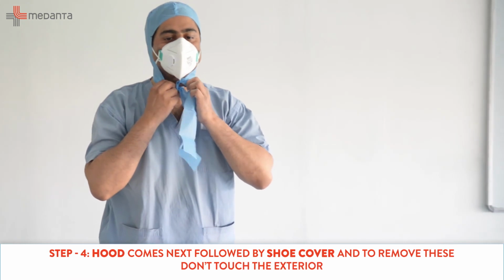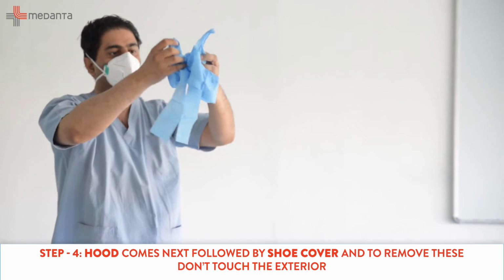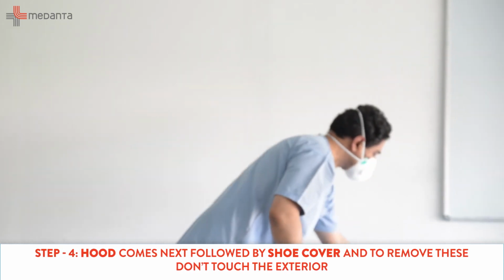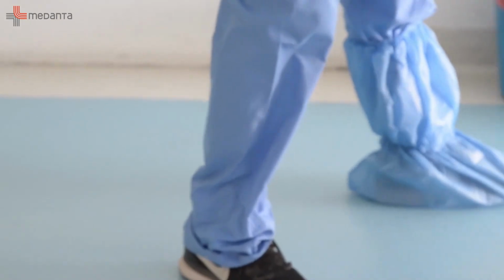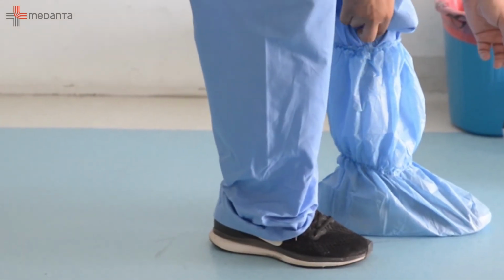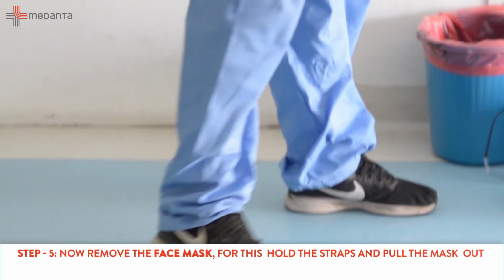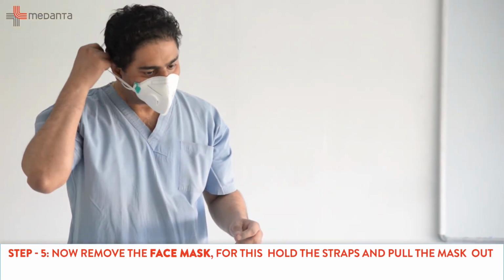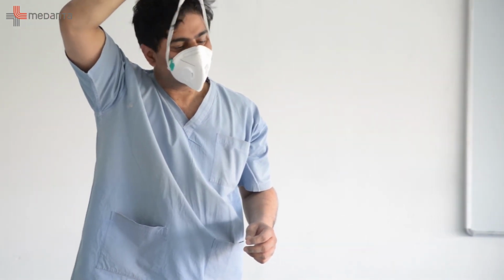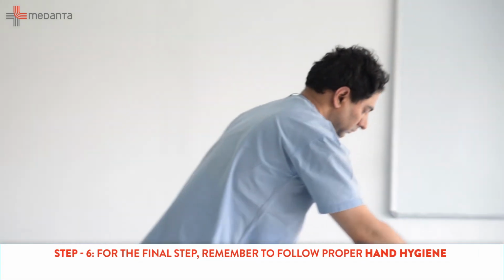Next to come off is the hood. Next is the shoe cover. Don't touch the exterior. First one shoe, then the other shoe. Last to come off is the mask. So hold the straps of the mask, pull it out, discard it. The last step is to practice your hand hygiene.